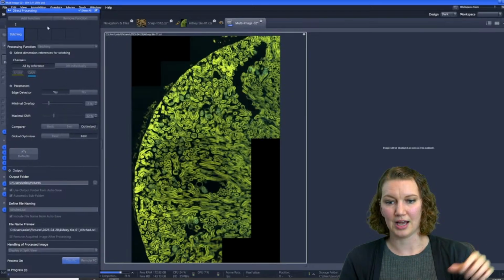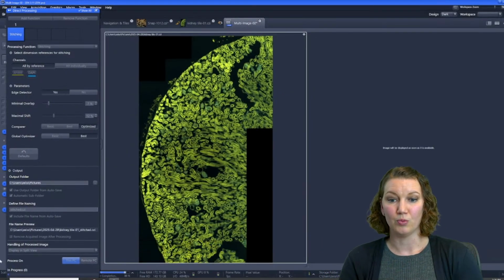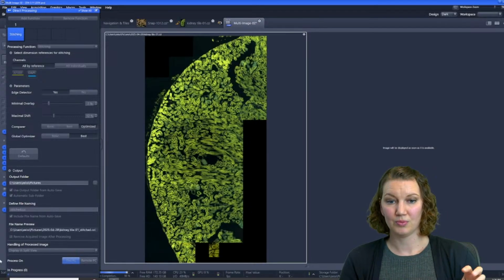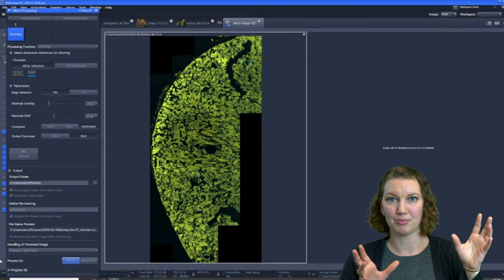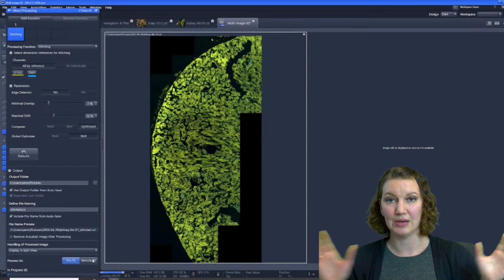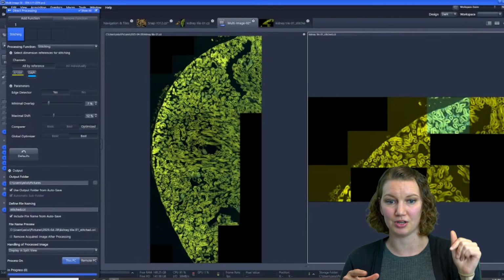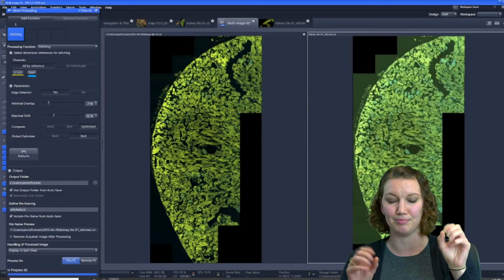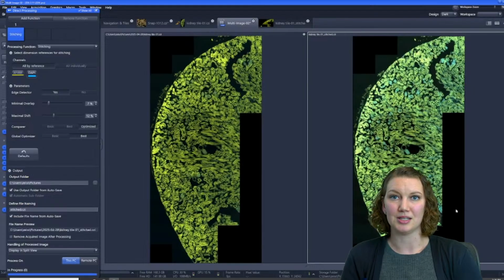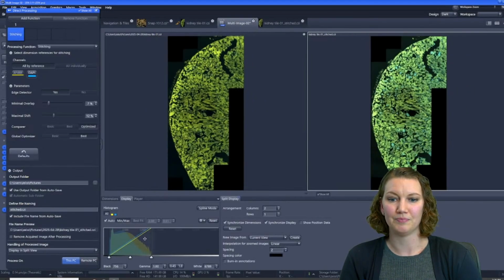And so you can see here, right, we're capturing just a basic Widefield image, 2-color. And once it's done tiling, we will see in a couple seconds the stitched image pop up on the right because we already set that up and built it into our workflow. So you don't have to take any additional steps once you start your experiment. It'll process for a second and boom. Now we can see side by side. There's even a little notification that popped up that'll let you know direct processing was done.